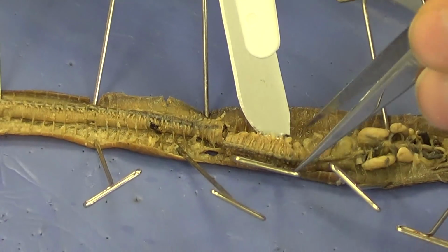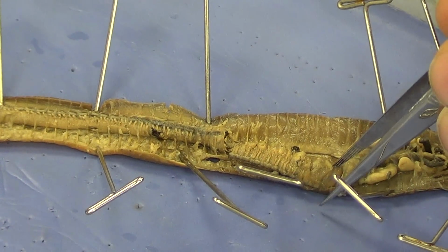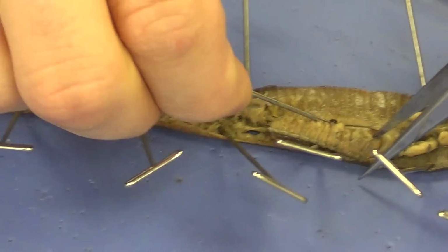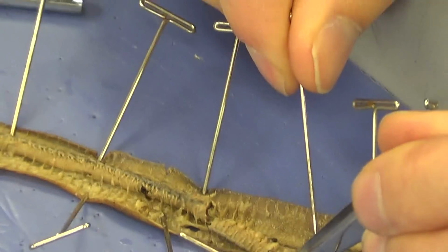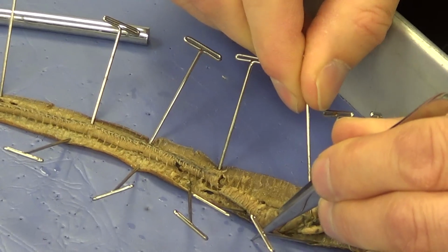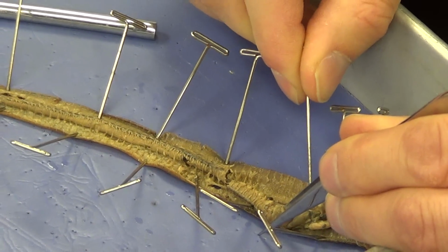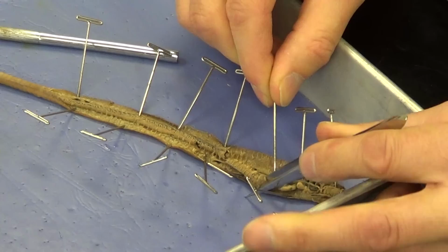And where is it? It's coming into view right now. So I'm going to move this over just a little bit. I'm going to hold this out of the way so you can see this. And if we look in there, you can see this white structure right there. It looks like a white piece of thread. And that white piece of thread is going to be our nerve cord. You can see it right there.